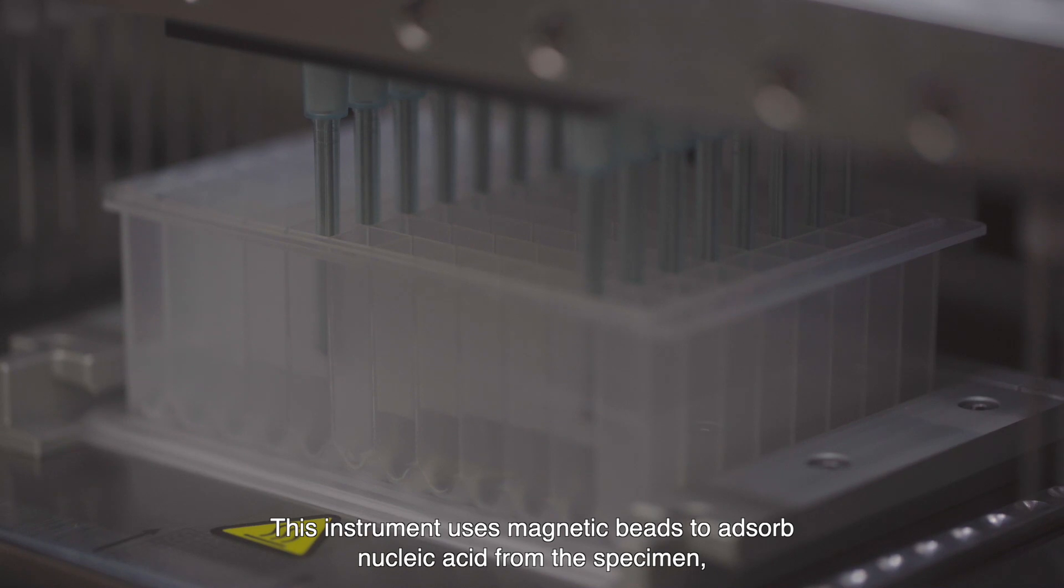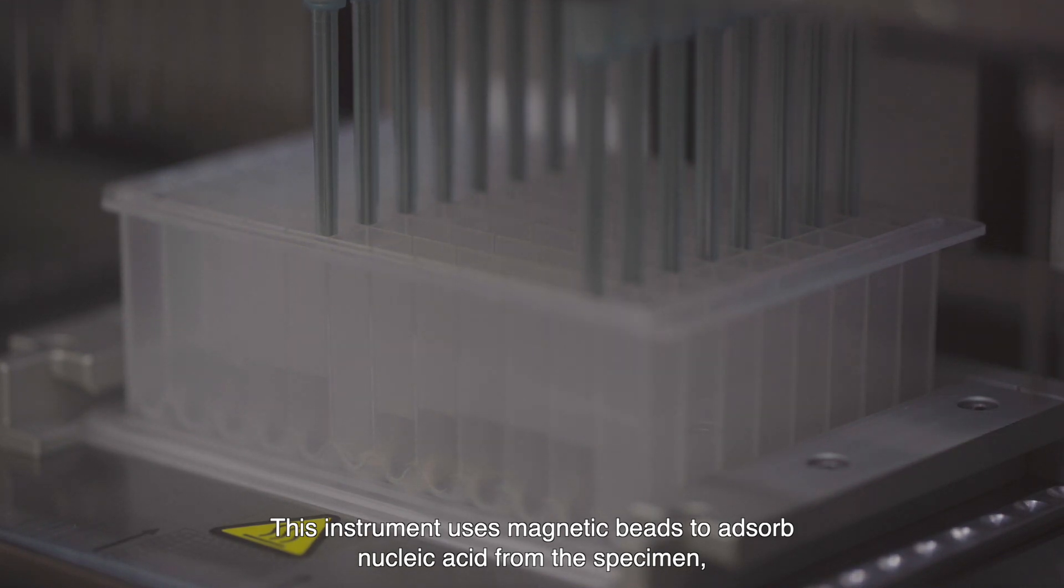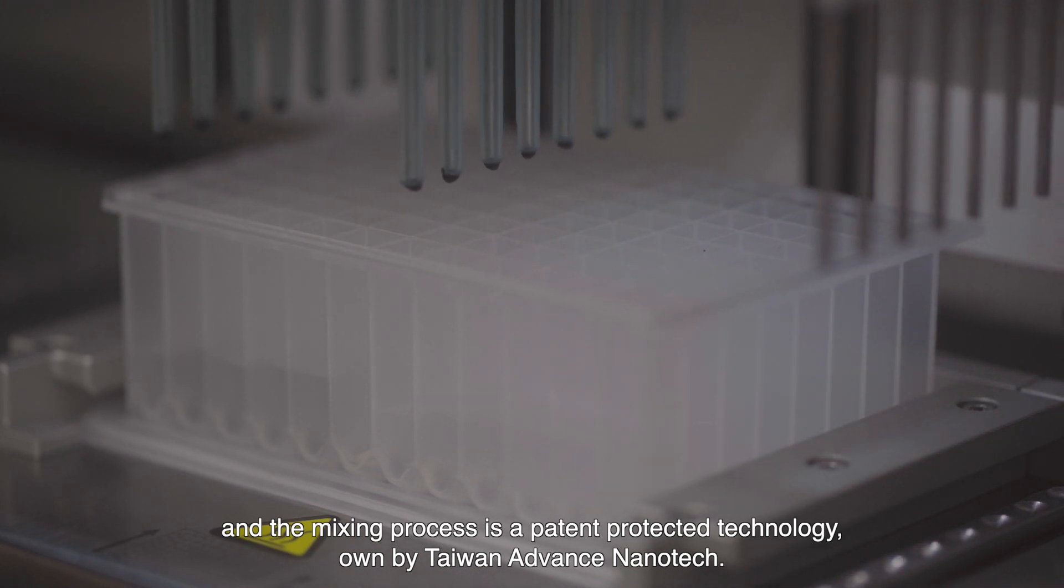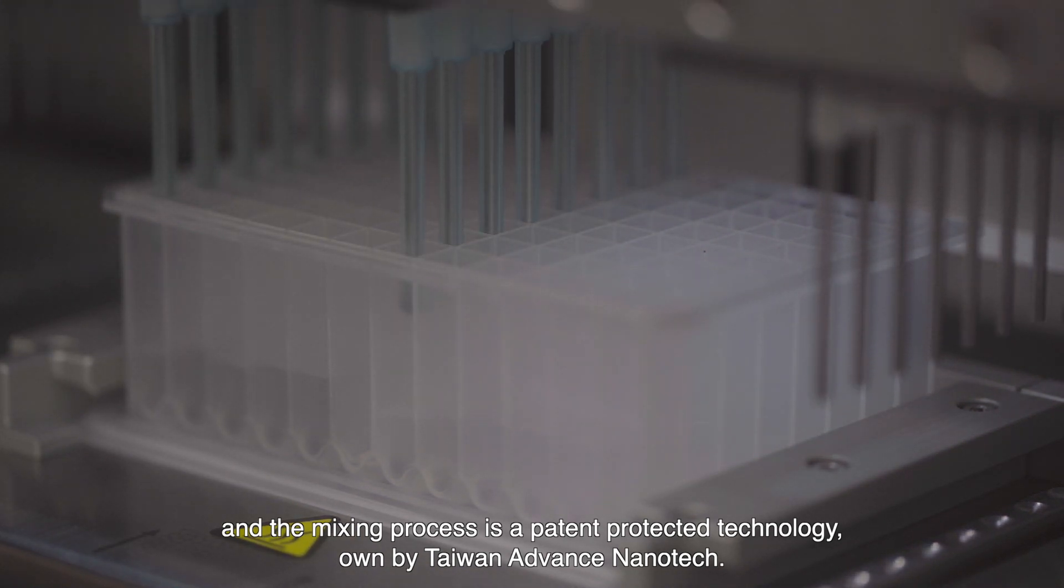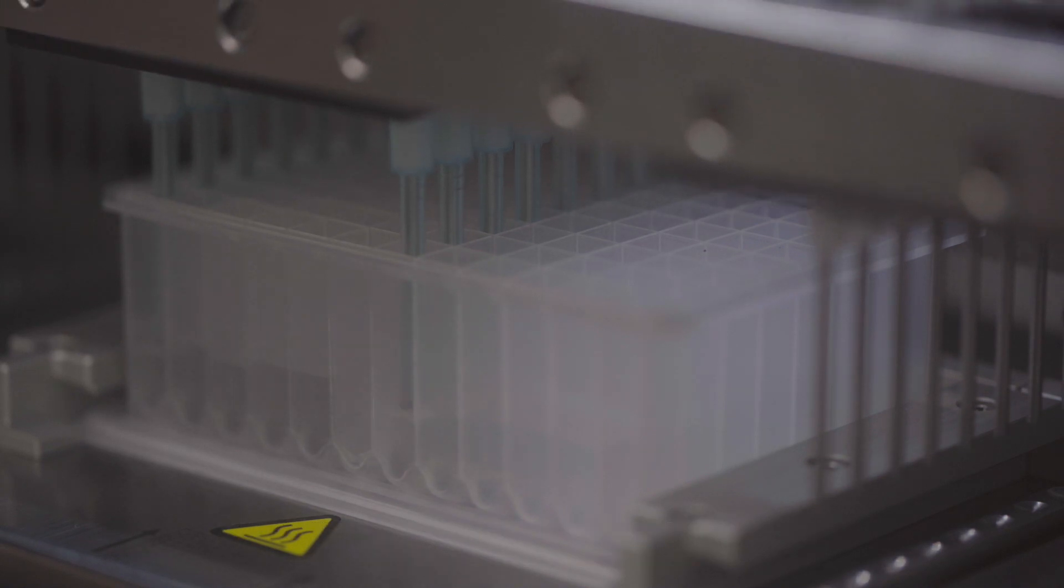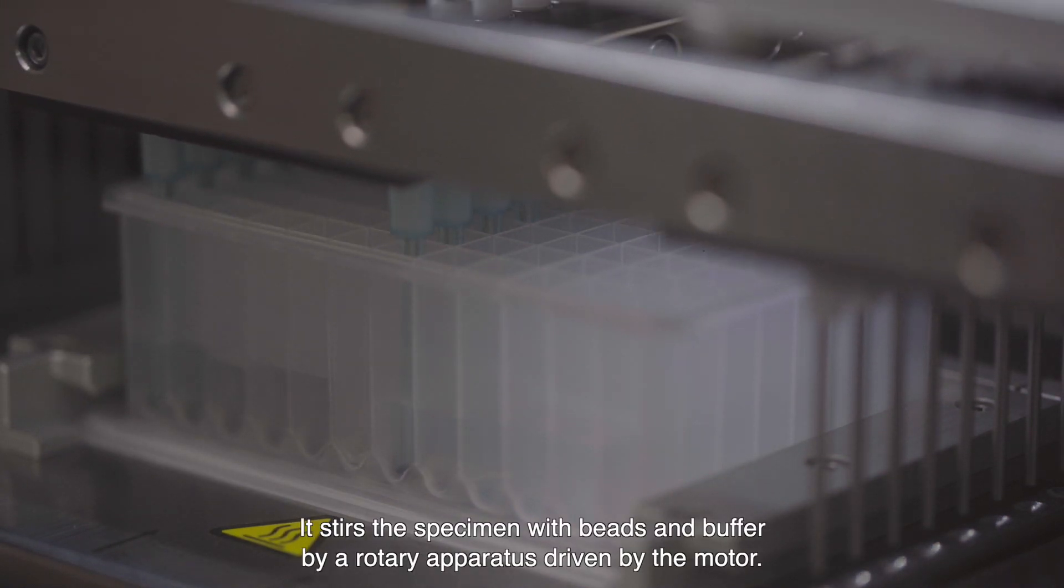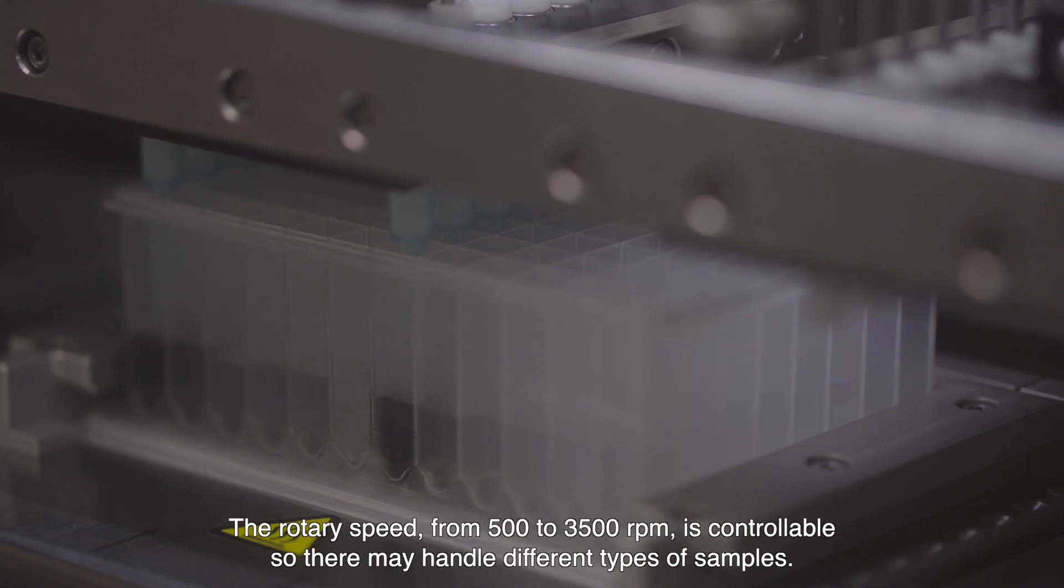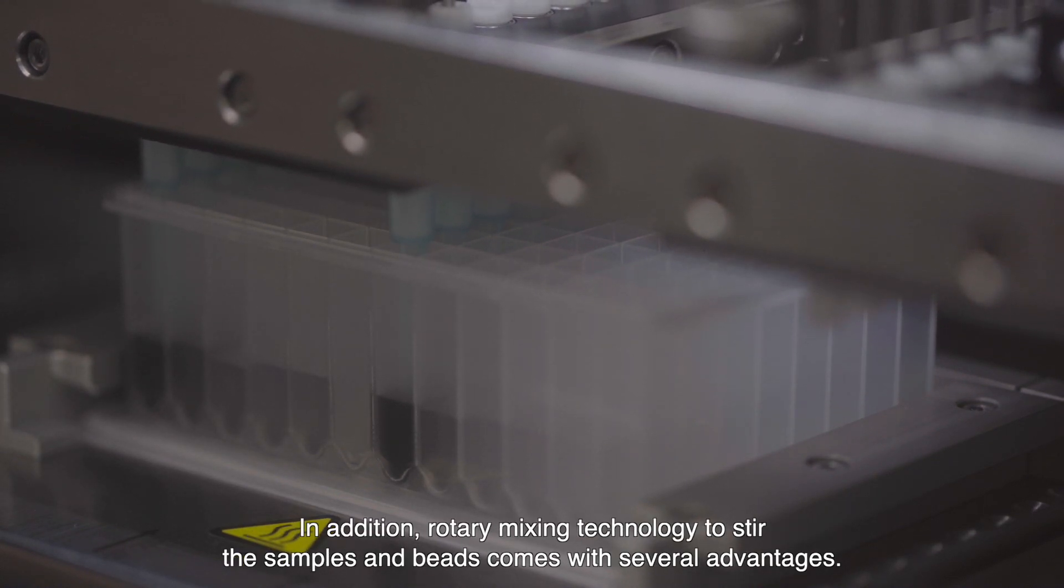This instrument uses magnetic beads to adsorb nucleic acid from the specimen and the mixing process is a patent protected technology owned by Taiwan Advanced Nanotech. It stirs the specimen with beads and buffer via rotary apparatus driven by the motor. The rotary speed from 500 to 3500 rpm is controllable so that it may handle different types of samples. In addition, rotary mixing technology comes with several advantages.